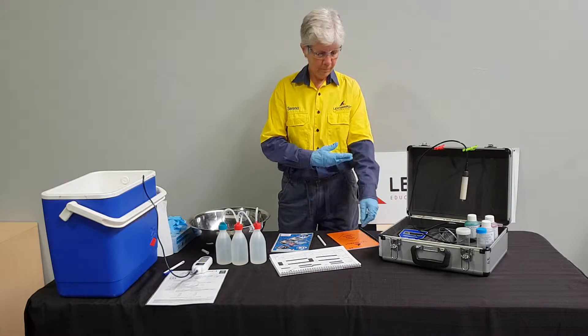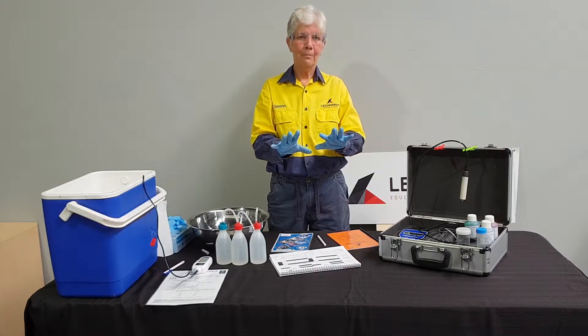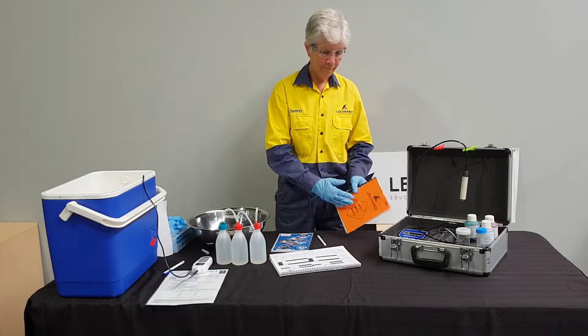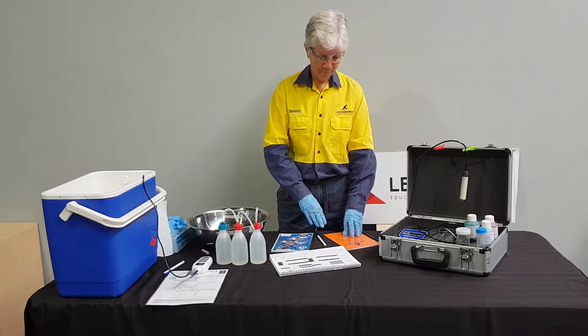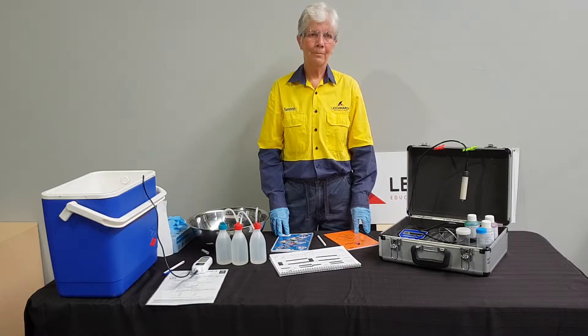Serena is wearing chemically resistant clothing, eyewear and impervious gloves, as these were listed in the SDSs for the chemicals provided in this kit. Always read the SDSs and apply the recommended PPE whenever you use chemicals.